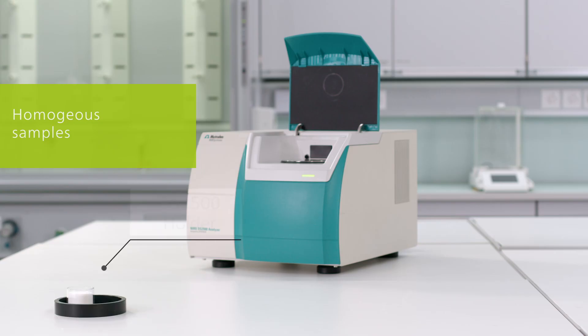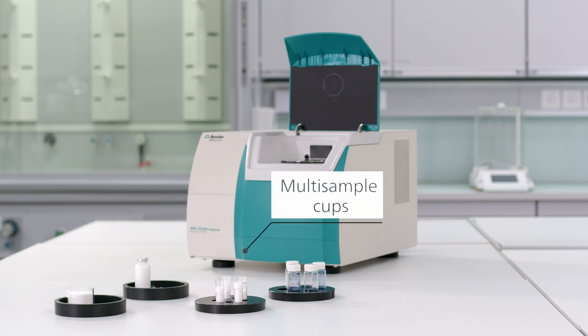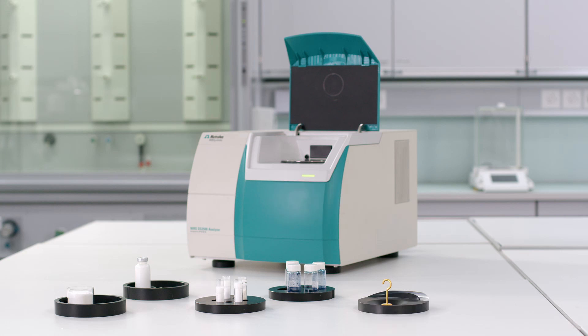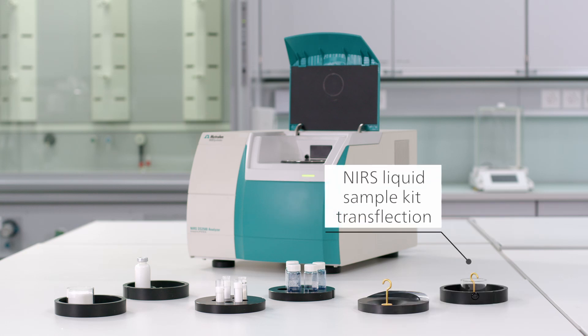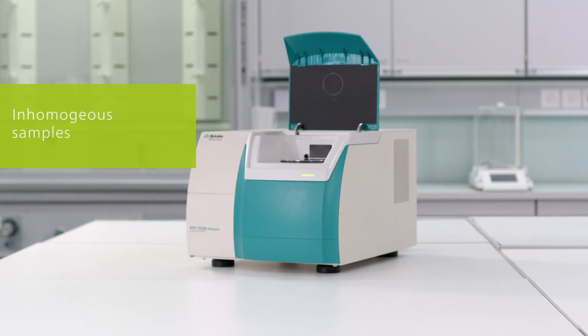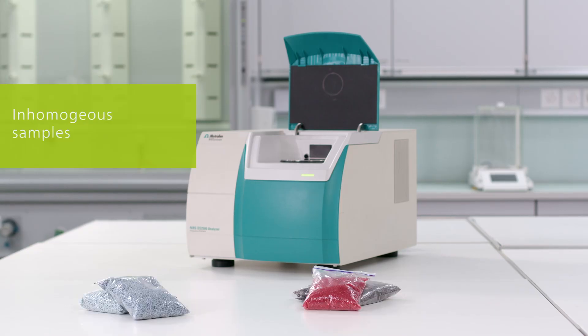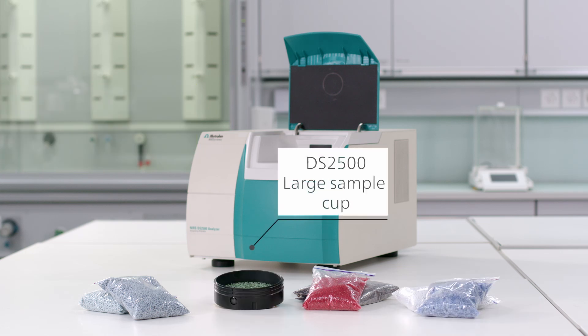Homogeneous samples like fine powders are measured in disposable vials or small sample cups with the corresponding holders. For pastes and gels we use the DS2500 slurry cup holder or the liquid sampling kit. During the measurement the sample is not moving and all the scans are taken at the same spot. Inhomogeneous samples like pellets, granules and flakes are measured in a large sample cup.